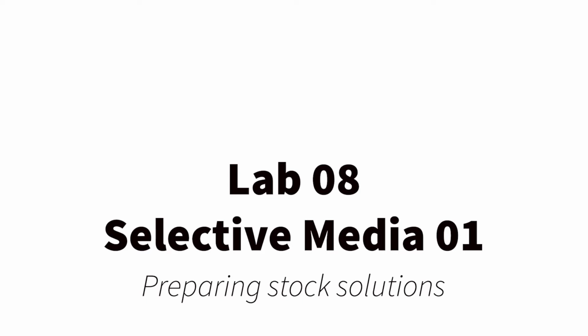So this is lab 8, and it's our first of 3 labs that are investigating selective media. And this first one, selective media 1, is going to be focused on bioprospecting for starch degrading bacteria. This is going to be a series of videos that will allow you to get through this first selective media lab.